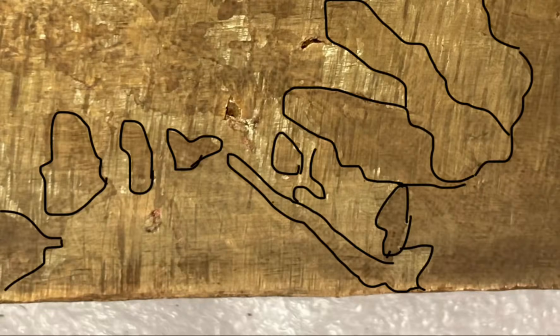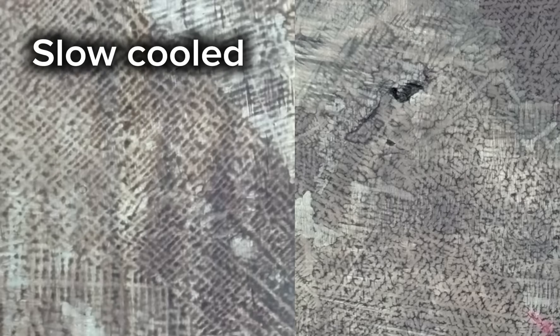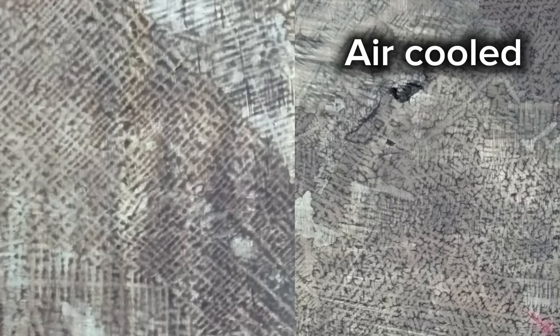Now the slow-cooled ingot is the complete opposite. These grains are massive — several centimeters across — but there are no dendrites. Now if we look at our ingot that was cooled just in the solid-liquid coexistence region, we see that it's a sort of balance between the two extremes. It has relatively large grains, but it also still has dendrites. And the dendrites here are slightly larger than the air-cooled dendrites, however they aren't as sharp — they're a little blurry.